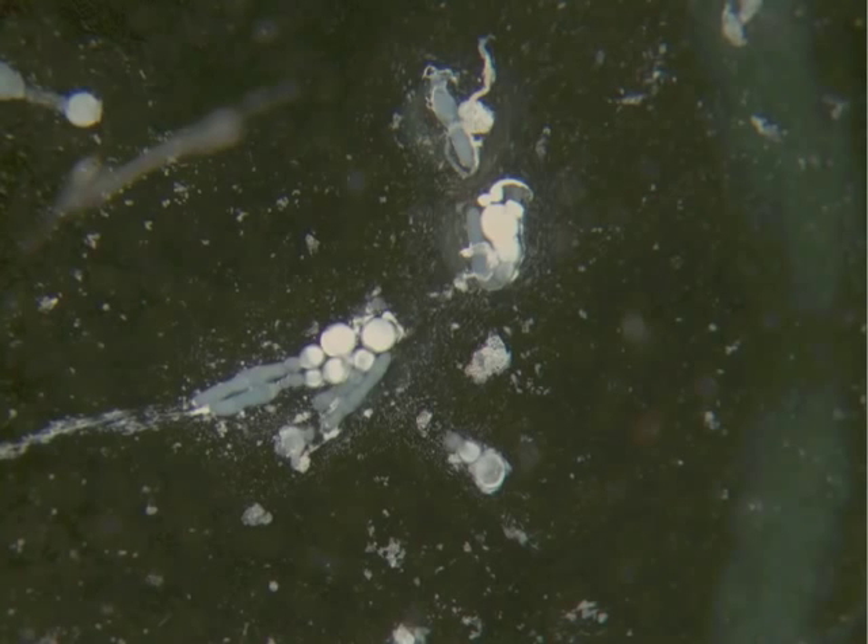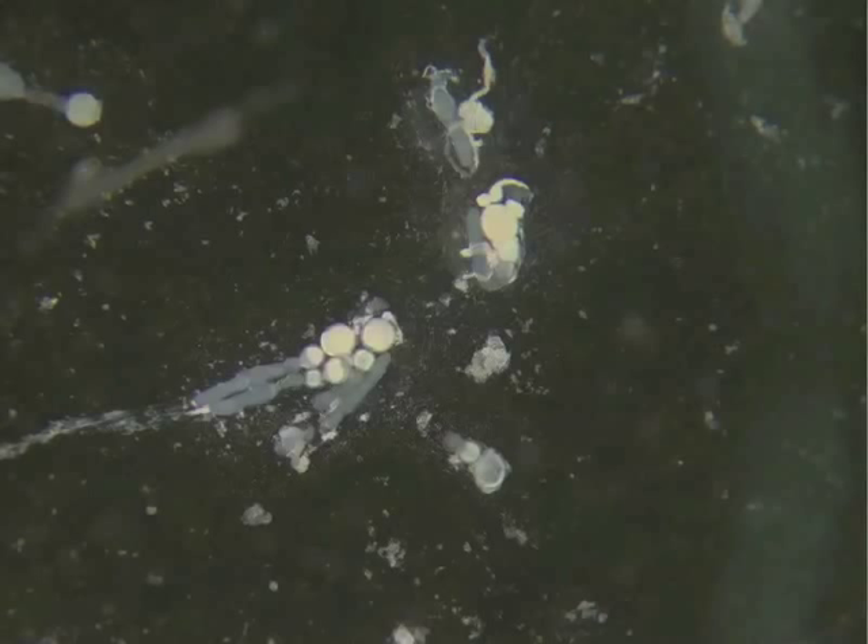When you've finished your dissection, hopefully you'll have about five to seven nice ovarials and you can begin your staining. Otherwise you may need to dissect an additional bean beetle.